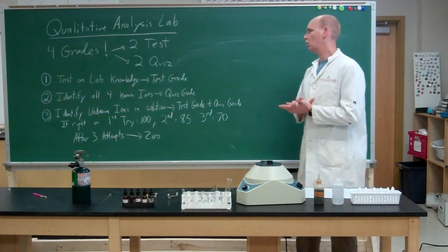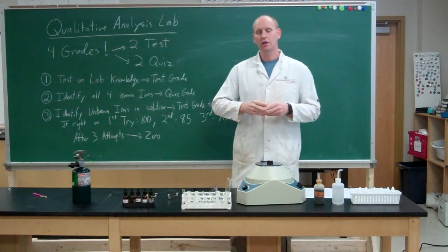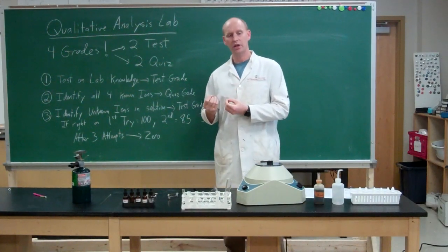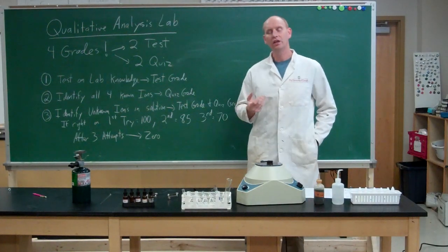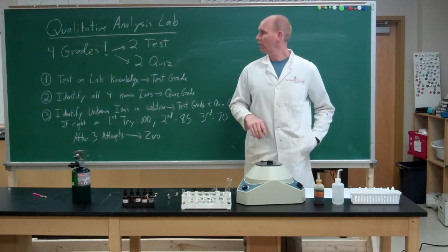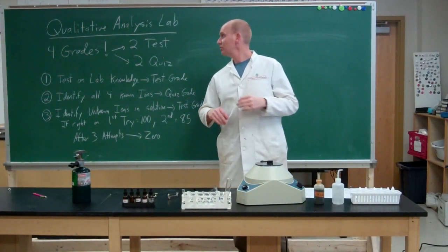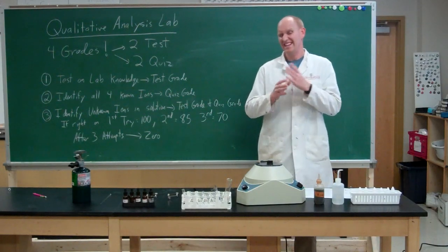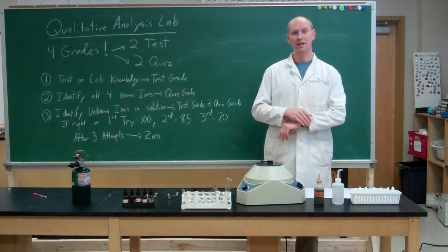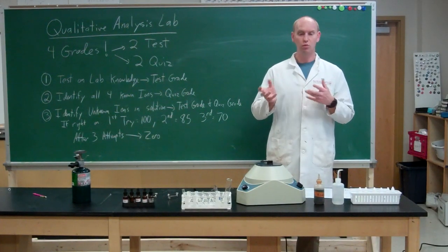All right, so our qualitative analysis lab. The difference in qualitative and quantitative is that quantitative uses numbers and qualitative does not use numbers. So this is a qualitative lab, which means that you're not going to be doing very much math at all in this lab other than counting drops and just keeping track of where you are.